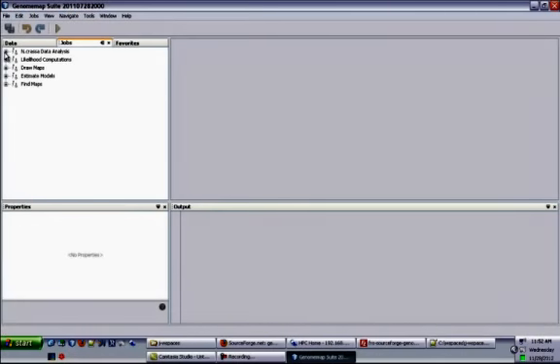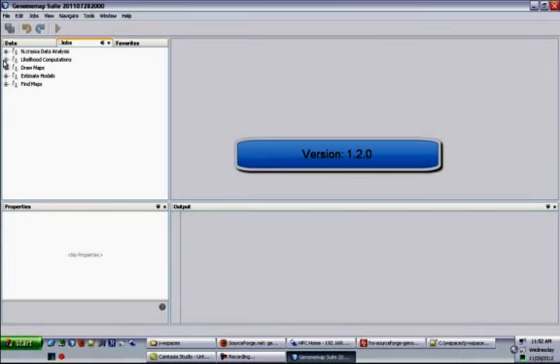We have added a few jobs in this release. The release number is 1.2.0.